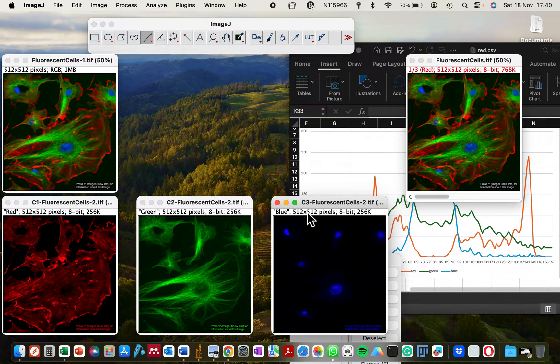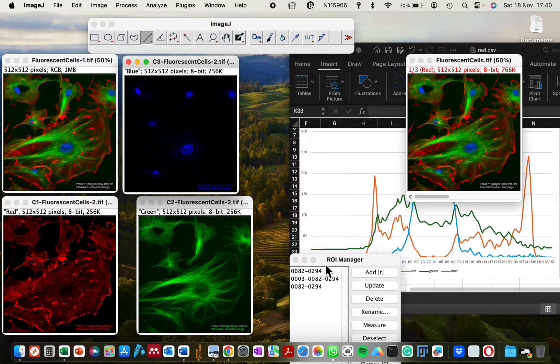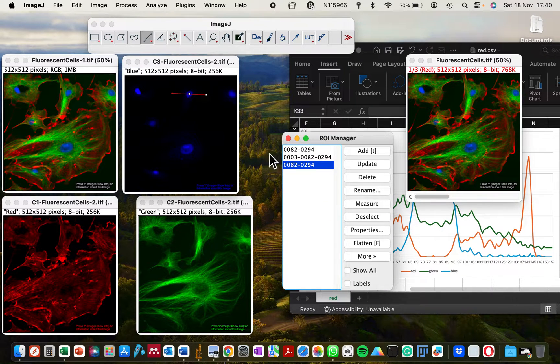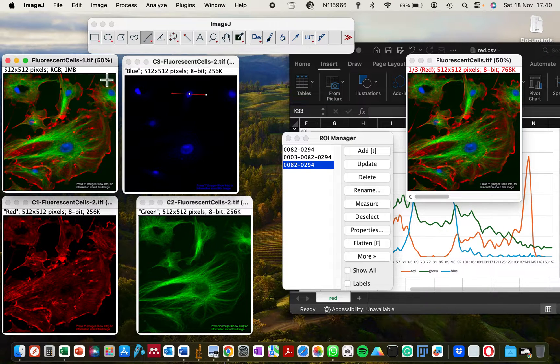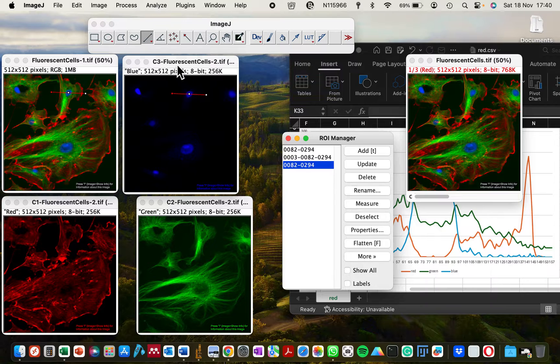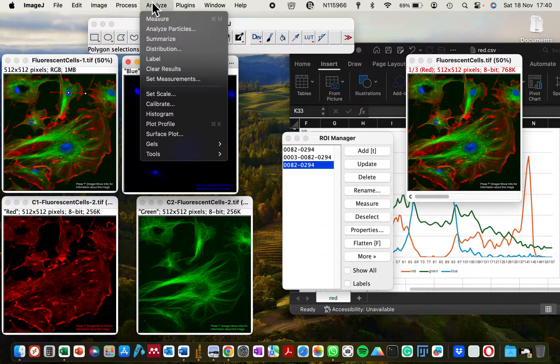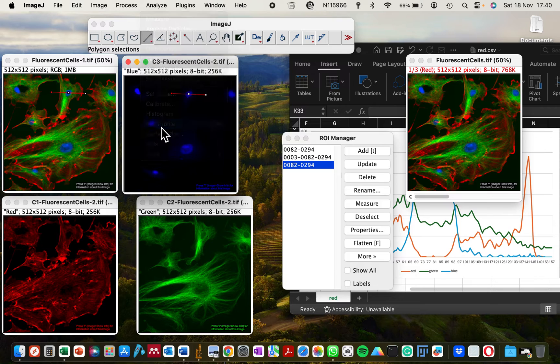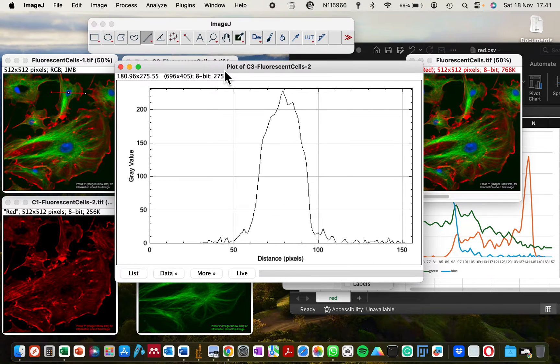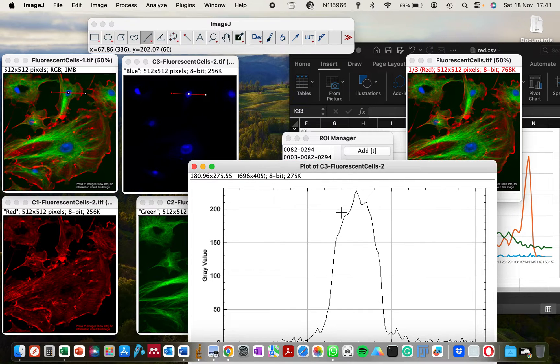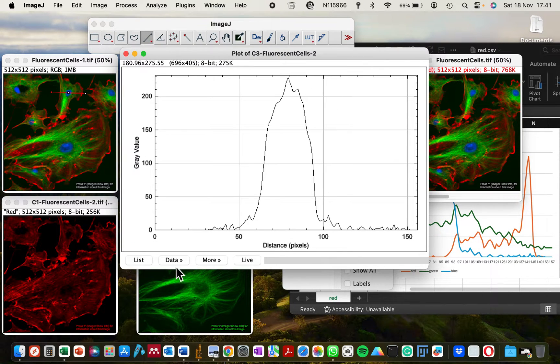Now I'm going to add the region of interest we generated earlier onto each channel image. You can see it marks the correct location on the blue channel image — the same location as on the original image. Now we can generate the profile plot for the blue channel by going to Analyze and selecting 'Plot Profile.' This has generated the plot for the blue channel, and we have the 'Data' and 'More' functions available here.